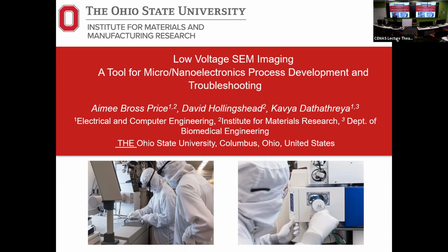So as part of that, I'll go through a little bit about Nanotech West, my Nanotech West commercial in the next slide. But a part of that is we have lots of open use user equipment, just like CEMAS, but we have about 55 pieces of user equipment in the clean room. And so we have electron microscopy and optical microscopy, as well as other metrology tools and analytical tools that we use as tools to evaluate our processes that we use to create devices and the fabrication side of things. And we also use those to evaluate devices.